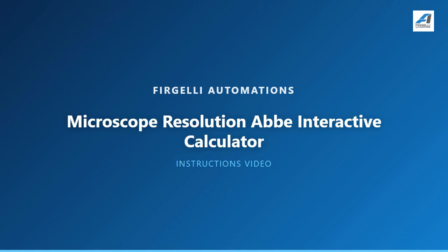Welcome to the instructions video for the Microscope Resolution Abbe interactive calculator. This tool helps you determine the theoretical resolution limits of optical microscopes using the famous Abbe diffraction formula. It calculates both lateral and axial resolution based on your optical setup parameters.